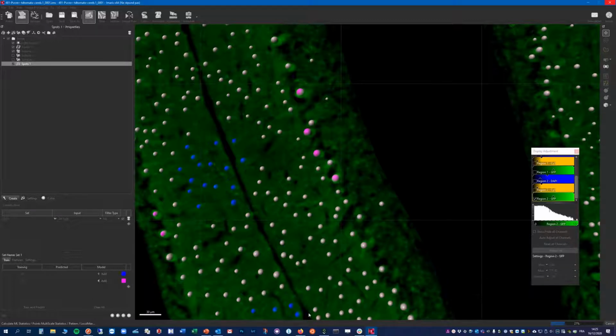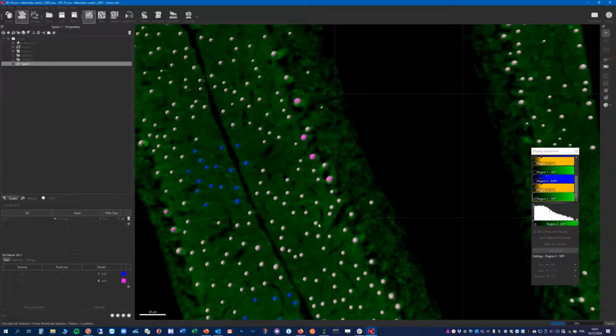So you can see the progress here. It takes time because it's doing many calculations. It will take into account all the measurements we had access to before using the filters, and try to build a machine learning model fitting the two classes we have defined here.